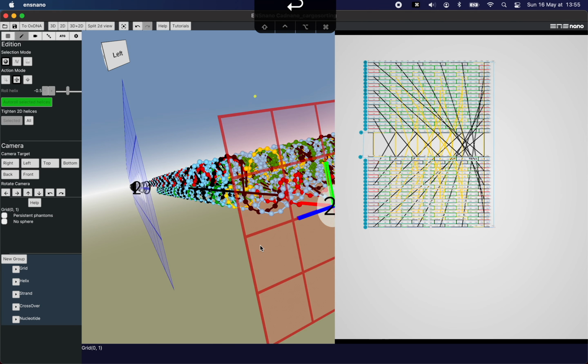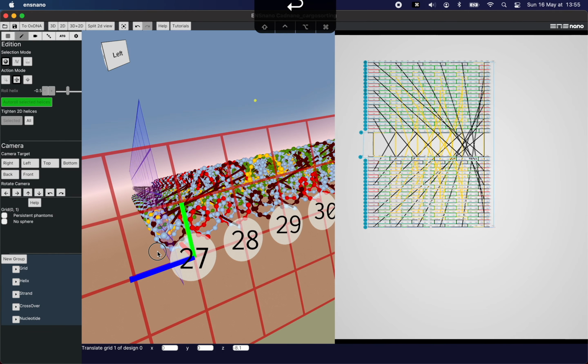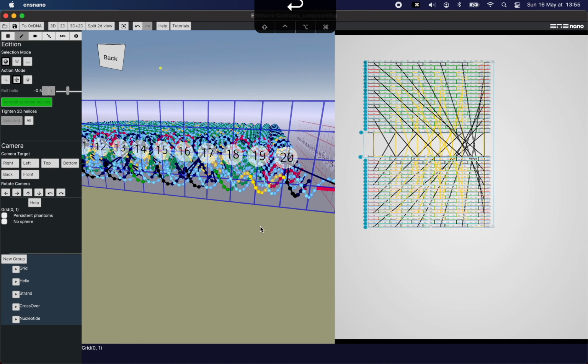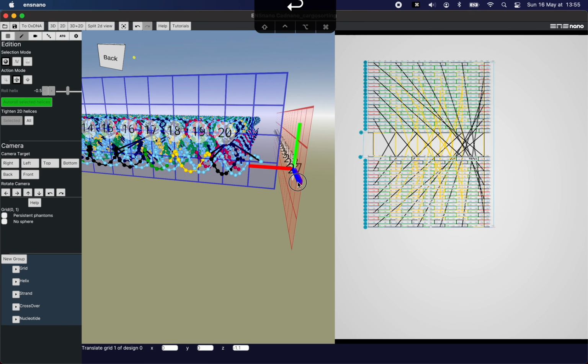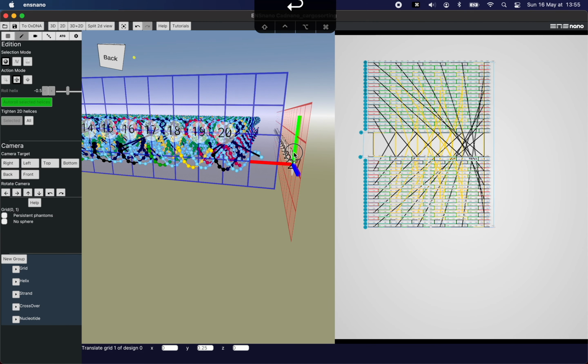And we can use the handles to check that the alignment is indeed correct, as follows. What I will do is bring the red handle close to the grid, and I want it to be aligned with the second one, so all the helices on the top layer are aligned on this line, and I want to align the other helices on this line, so this can be done with the handle.